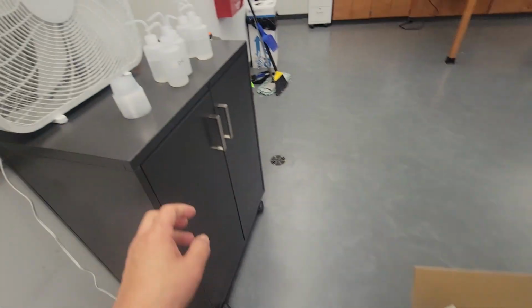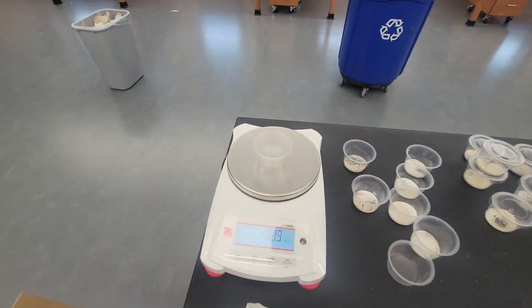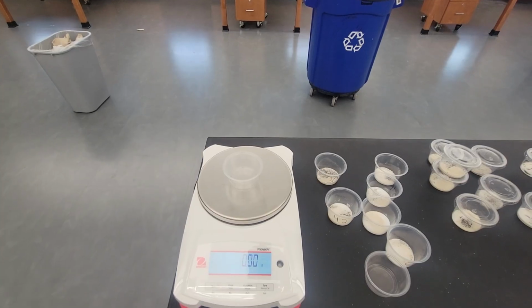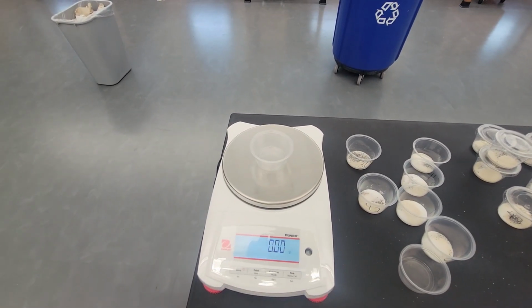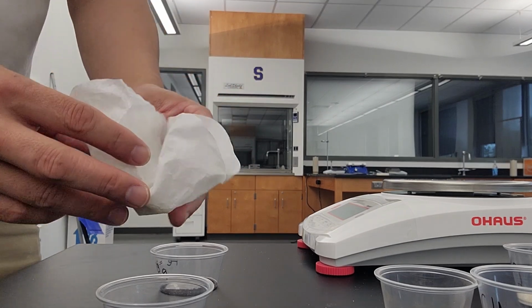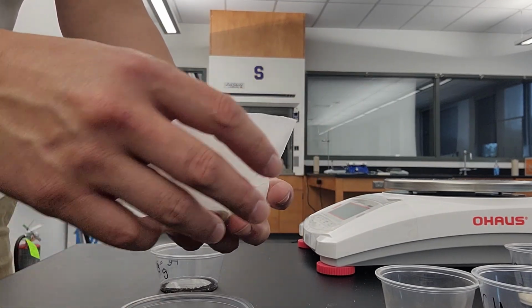Yeah, let me get another weigh cup. Now I'm going to need both hands to transfer this over, so I'll be right back. Just switched up the angle. So because this is nice and dry, it should just slide right in.